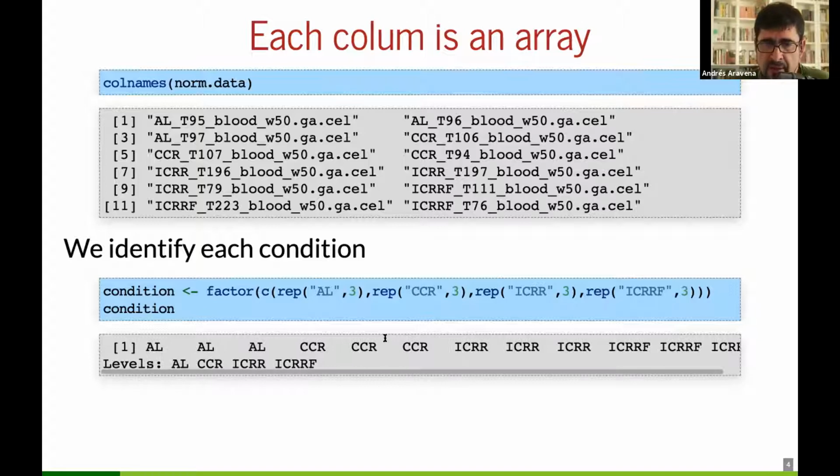Everybody follow what I'm doing here? Now I have 12 values, and they correspond to the conditions, 1 for every column. So I'm forgetting all the detail about the replica, the tissue, the time or age, the data format, all the things. The only thing that we care about at this level is the diet.